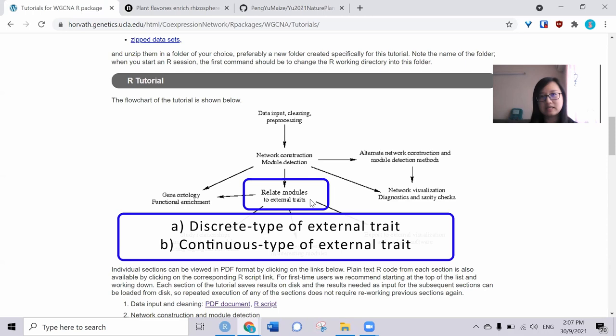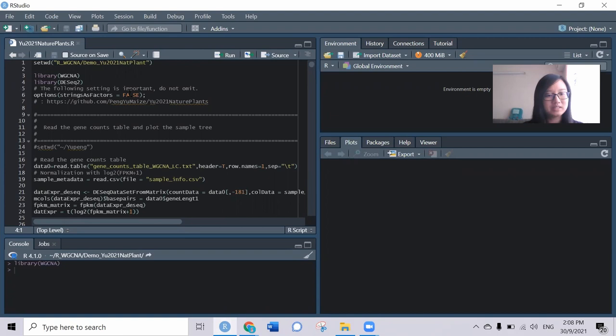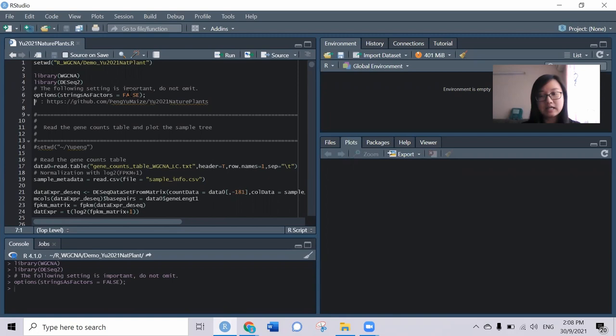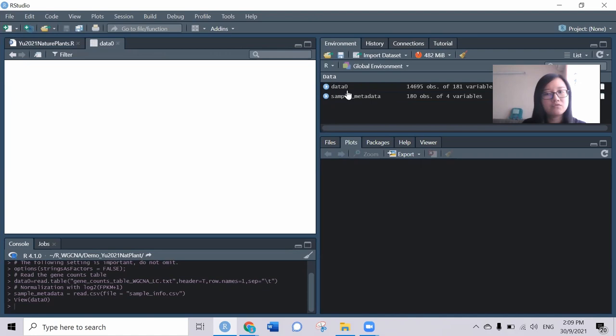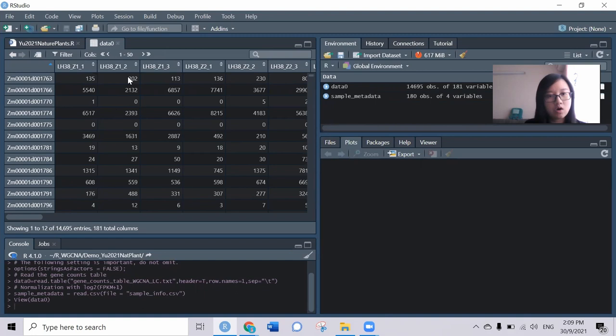So let's run the script. We need all the libraries: WGCNA, and DESeq2 will be used to generate the FPKM value for the gene count data. I load the gene count data and the sample information. Let's have a look. For the gene count data, they have 181 columns.